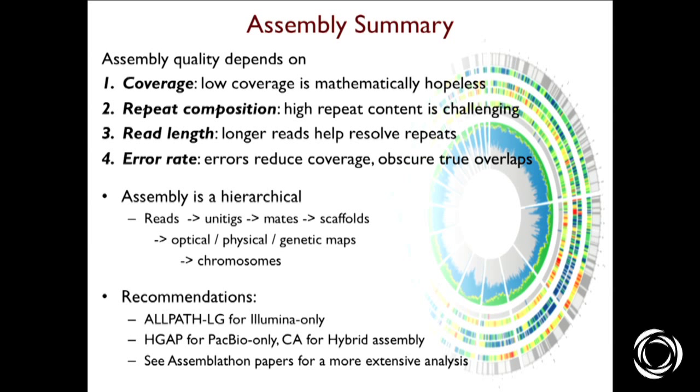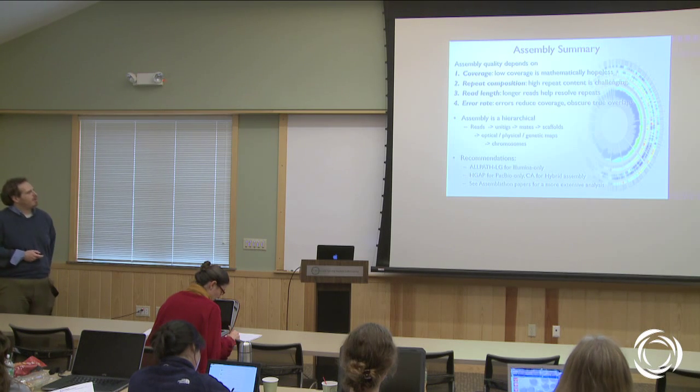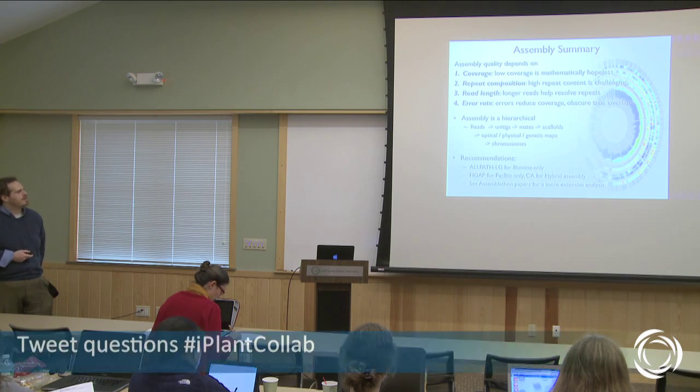My strong recommendation today is, if you have a big genome, it's expensive to do the single molecule sequencing, so I strongly encourage you to use the ALLPATHS recipe, using the ALLPATHS assembler. If you have access to it and you can afford it and things are going well, today the longest reads I've ever seen have been using PacBio.